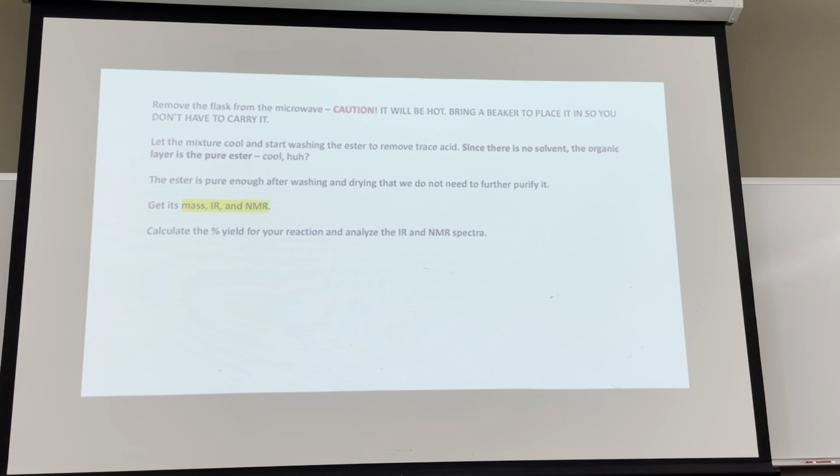Anybody have questions on that? We're supposed to wash it 3 times with sodium bicarbonate or 2? Whatever it says in the lab manual, does it say 3 times? Okay, then do it 3 times. Do you still want us to do it with water? Yes, do it with the water. Okay, so 4 times.